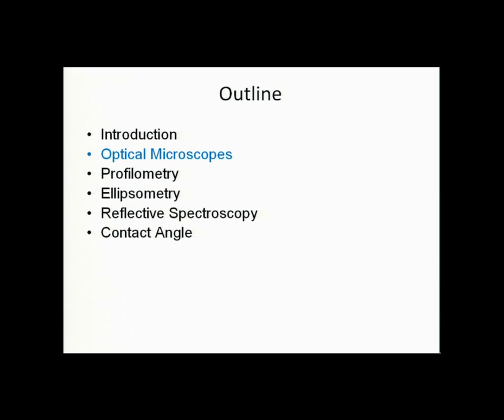Okay, so that's it for our introduction. Now let's go ahead and look at some of these characterization tools. Our first one up for discussion is optical microscopes.